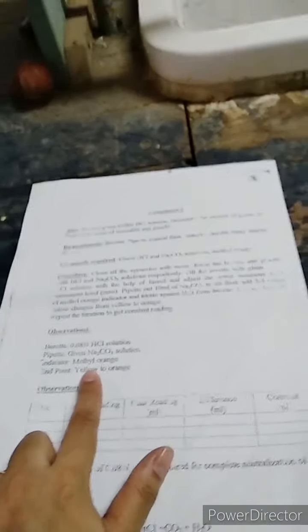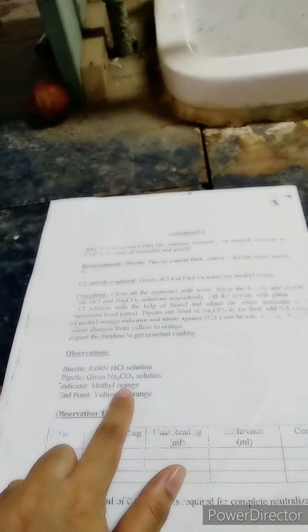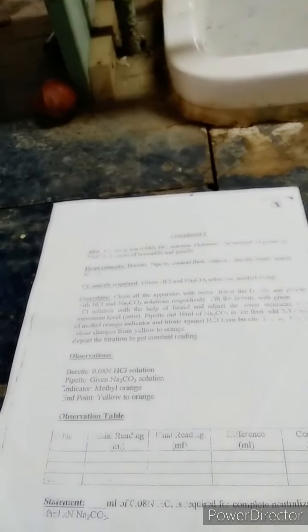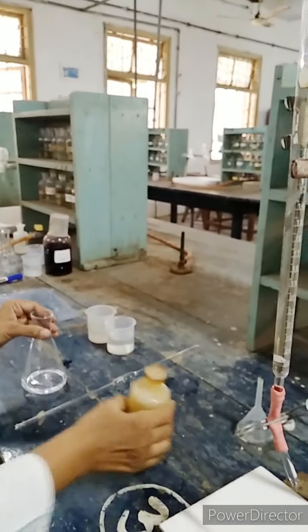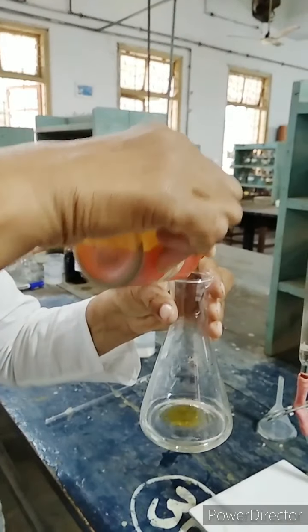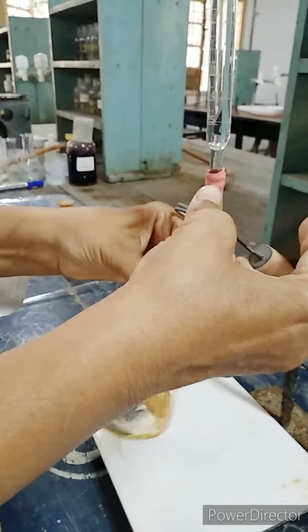Now, for today's case, we are going to use methyl orange as our indicator. In basic solution, methyl orange gives a yellow color, and in an acidic solution, it gives orange color. That's why today's endpoint is yellow to orange. This is our methyl orange indicator. The moment the methyl orange gets into the conical flask, you will see that it is yellow in color.